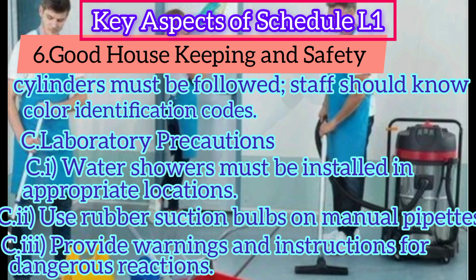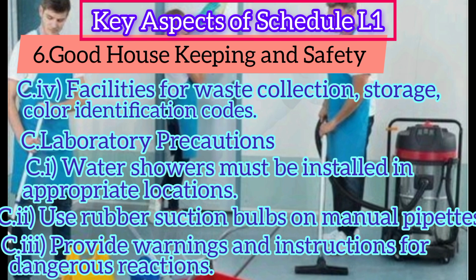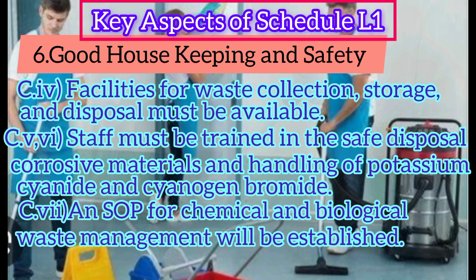C. Laboratory precautions. C.1. Water showers must be installed in appropriate locations. C.2. Use rubber suction bulbs on manual pipettes. C.3. Provide warnings and instructions for dangerous reactions. C.4. Facilities for waste collection, storage, and disposal must be available. C.5 and 6.